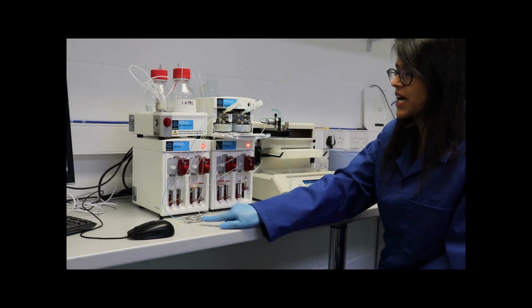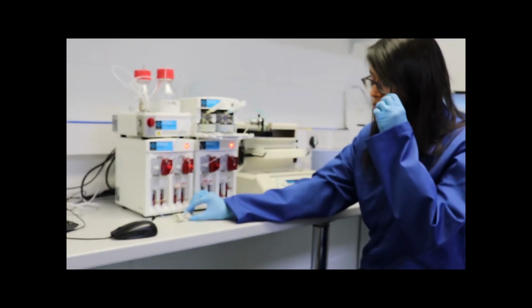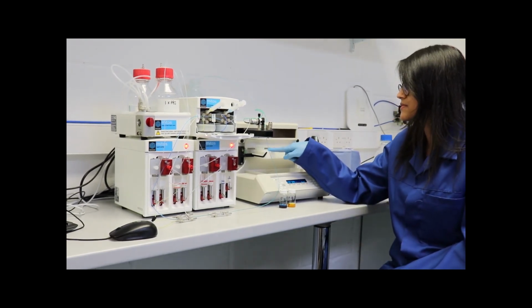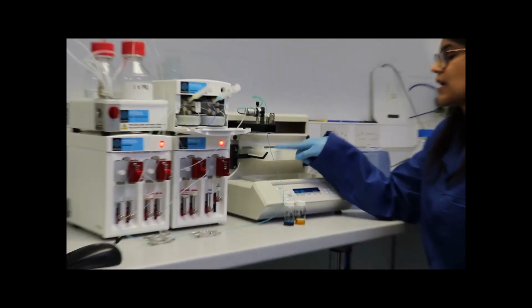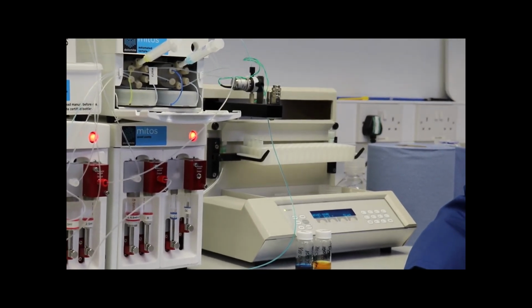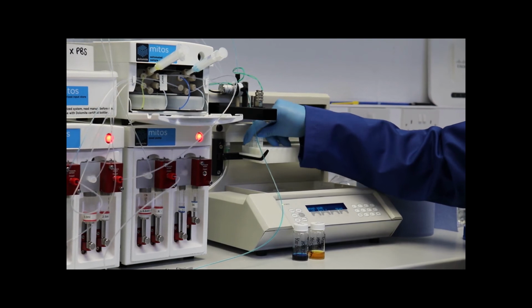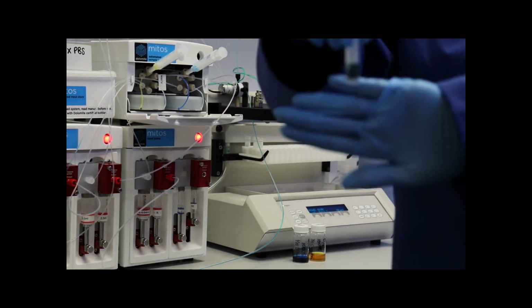So again, the dyes entered the first microfluidic chip. It's gone through. We can already see it turning green, and very quick, yeah, so it's going to start collecting now, which it is. Hopefully you can see that. So the collection has now finished. That's now gone to the wash pot to wash the nozzle. And again, we've got a nice 500 microliter sample.